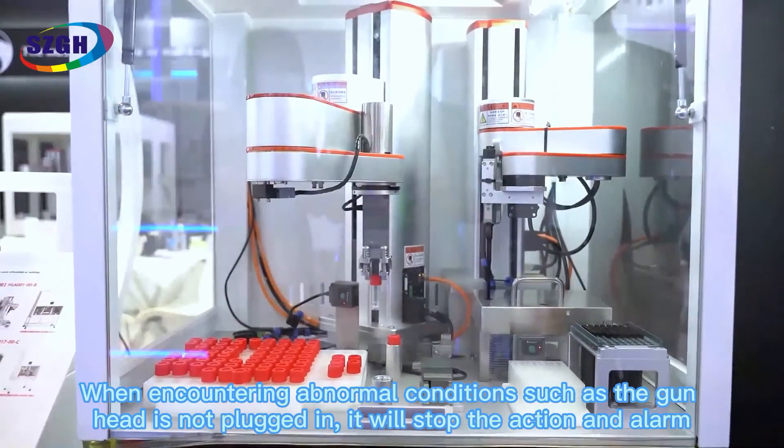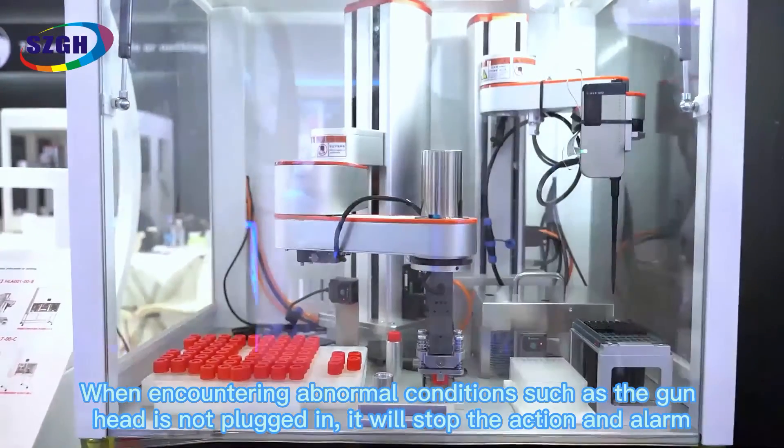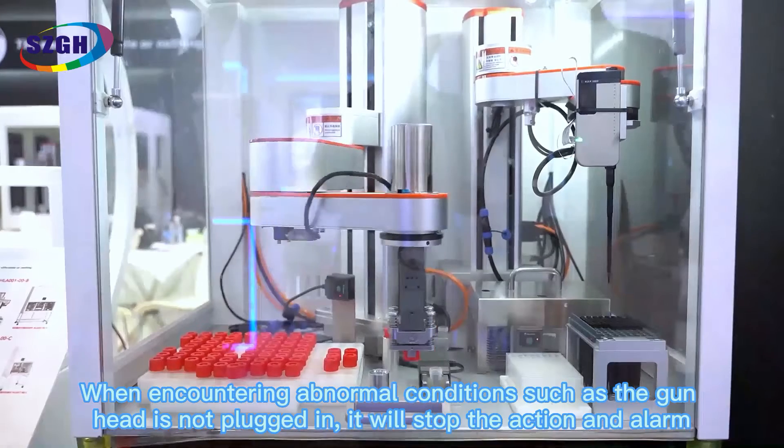When encountering abnormal conditions — such as the gun head not being plugged in — it will stop the action and trigger an alarm.